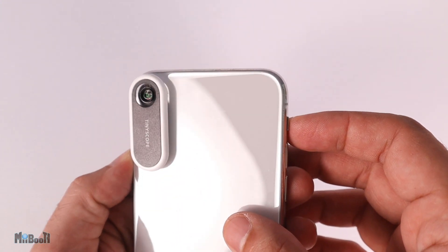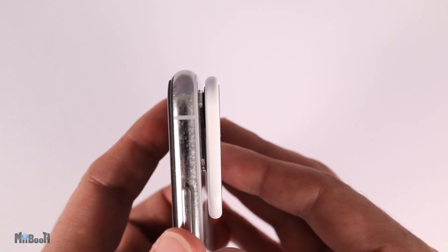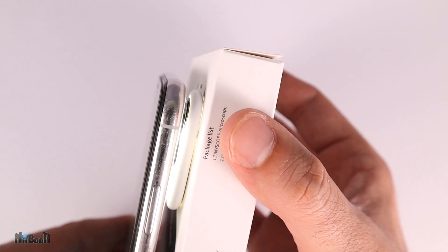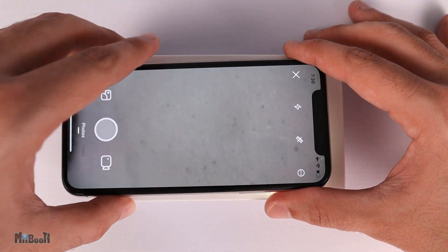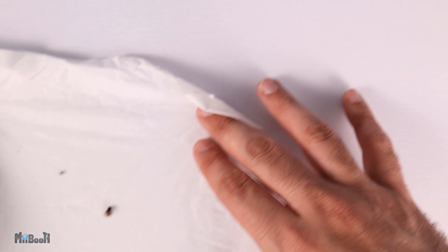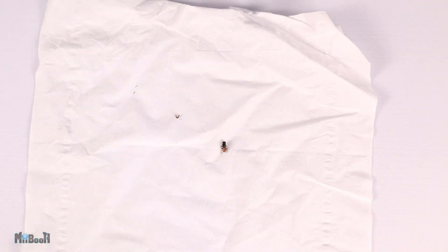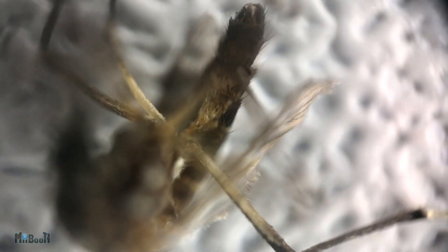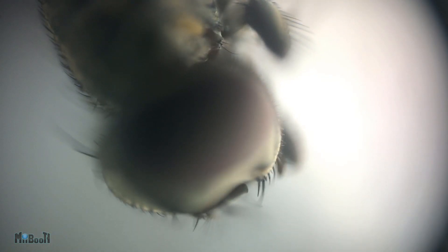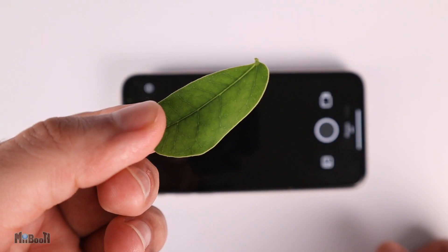You might wonder if dragging the lens on surfaces will scratch it — but they've thought it out. The lens is actually recessed inward so it doesn't contact the surface, and when laid flat, the subject is at the optimal distance from the lens. There was a suggestion to catch tiny bugs, so here is a mosquito and here is a house fly.